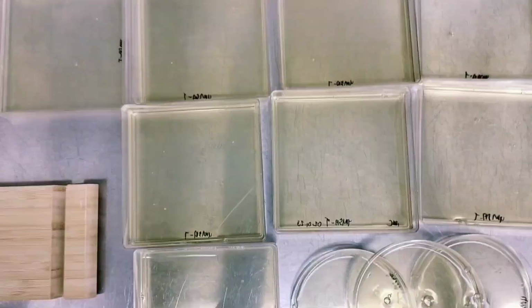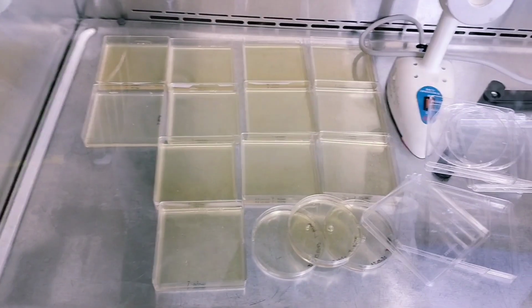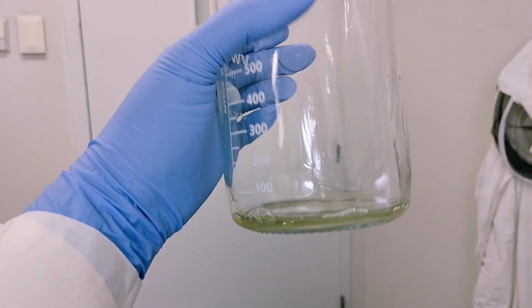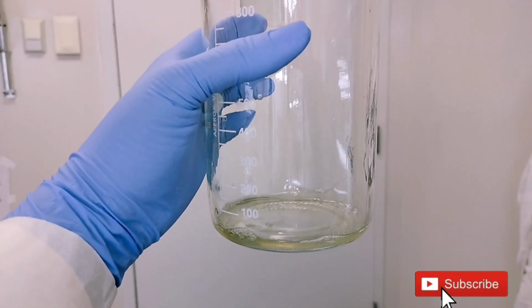While the plates are solidifying, I'm going to go add water to this and scour it, because once the agar solidifies, it's hard to clean.